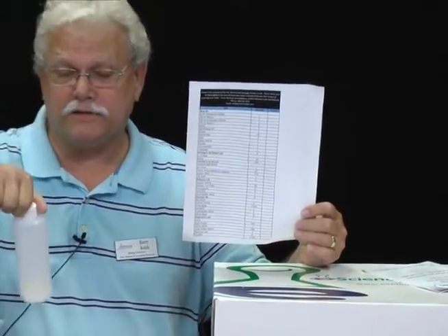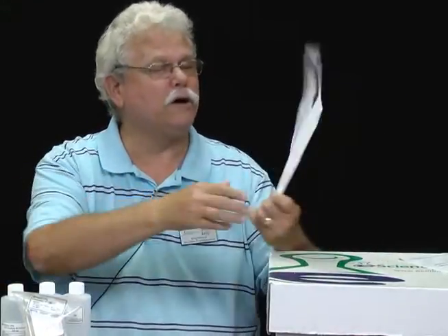Importantly, there is a packing list. The reason that I've got the packing list out is to show you that you can go through this list, check off items as you see them. For example, this is a bottle of sodium chloride. And if you look on the packing list, you'll see sodium chloride. Check that off, put that back in the box, and move on to the next item.